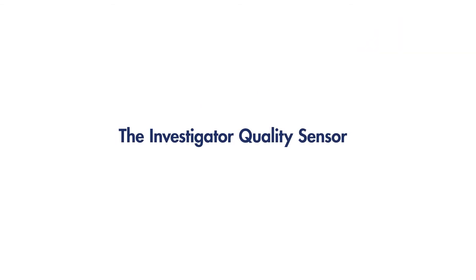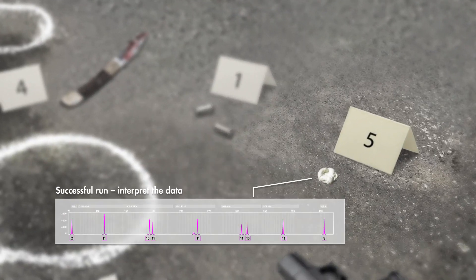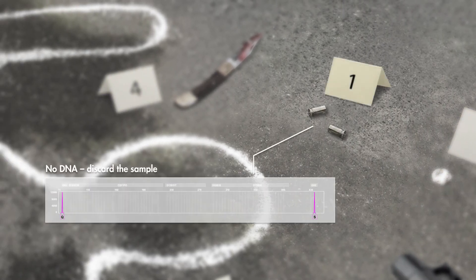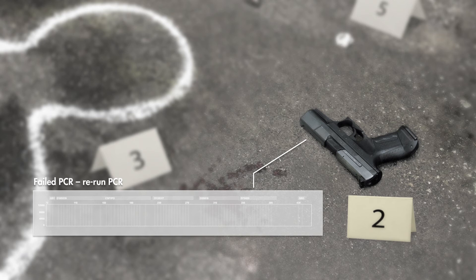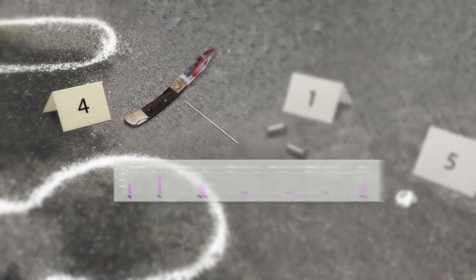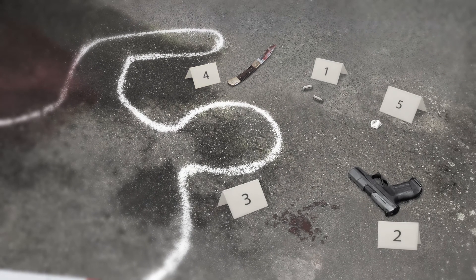Let's look at how the investigator quality sensor helps you in an example. The quality sensor results show you exactly what to do with each sample. You're sure you have a successful profile from the chewing gum, so you can move to data interpretation. There was no DNA on the gun shells — you can discard them. You should repeat the PCR of the sample from the gun because PCR failed; you could still get a good profile. The blood splatter samples contain inhibitors — you can dilute them and repeat PCR if you need those results. The DNA on the knife is degraded, so you'll hold off on doing anything with those samples. Thanks to the quality sensor, you have made confident decisions about every sample and saved time and resources.